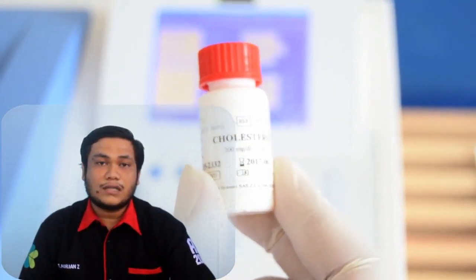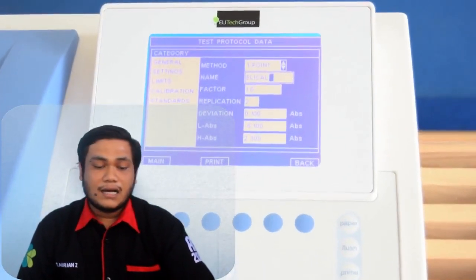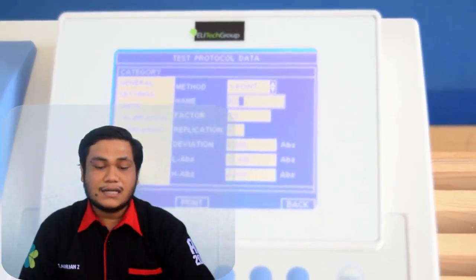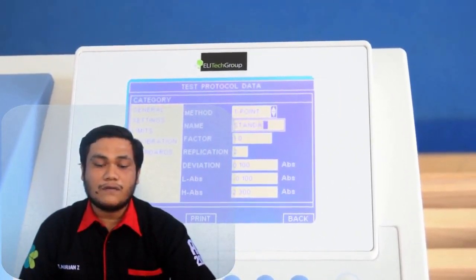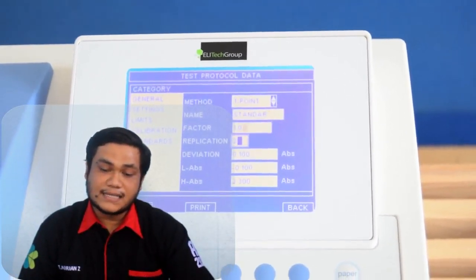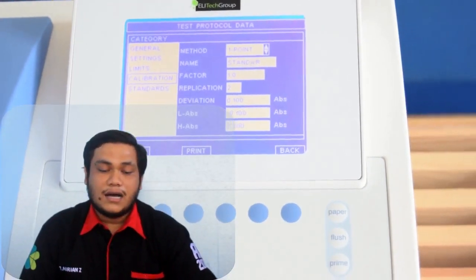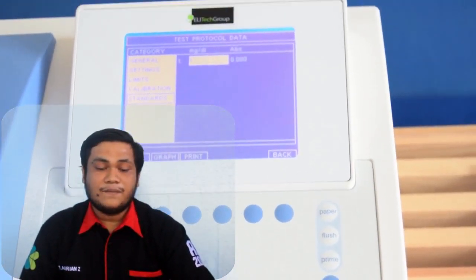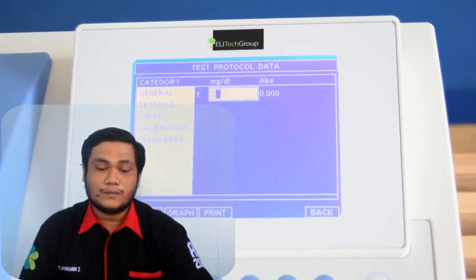Press the stop button on the soft key. Number 13. Tighten the X screw. Number 10. You can turn off the light by pressing the off button on the soft key. Then replace the metallic cover and tighten the screw.